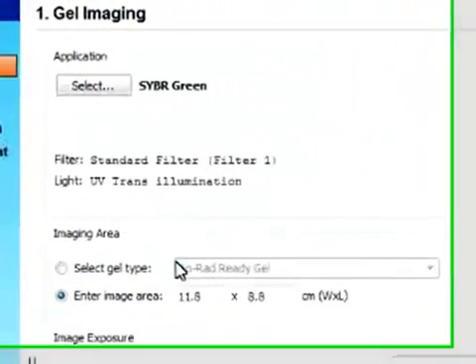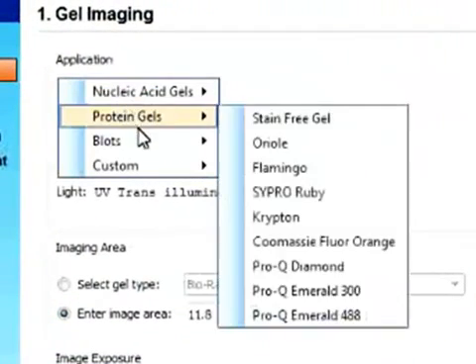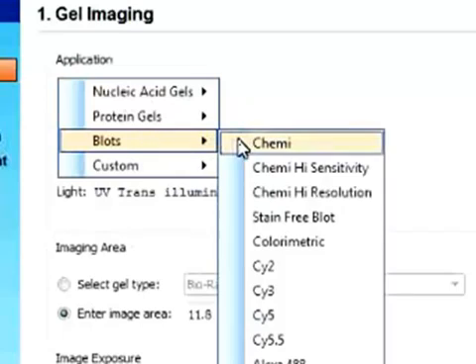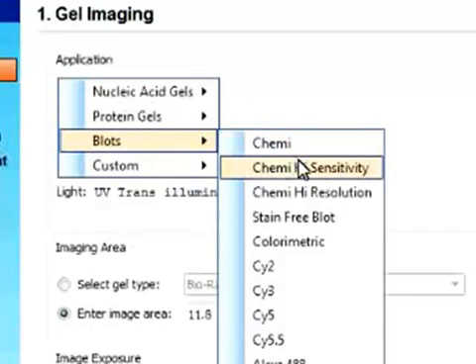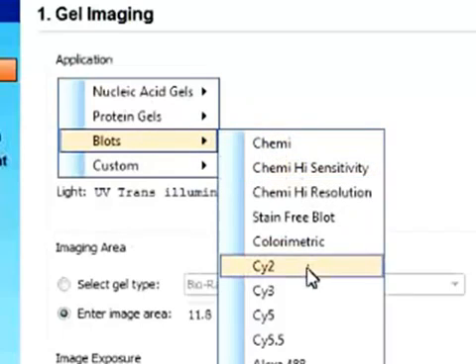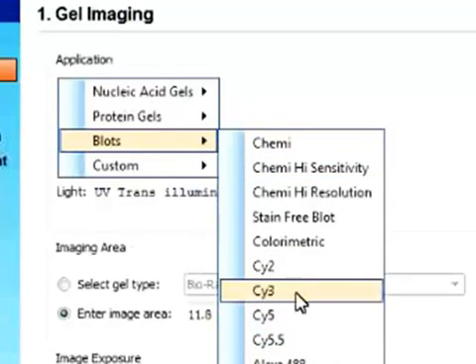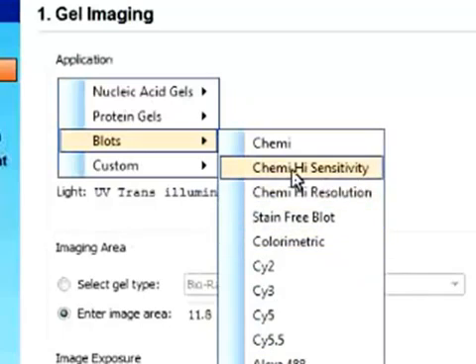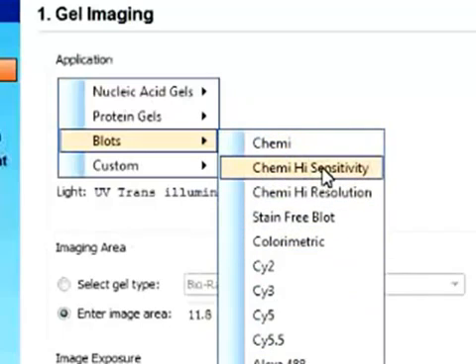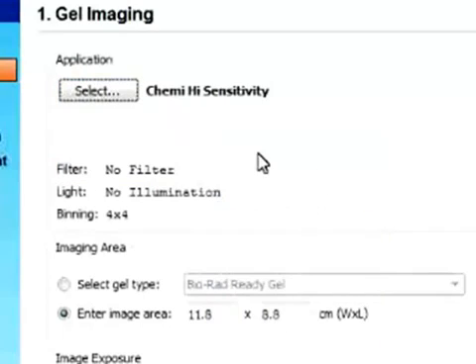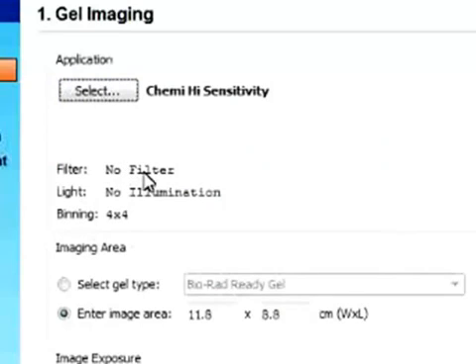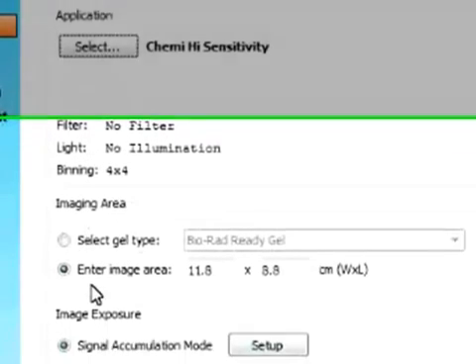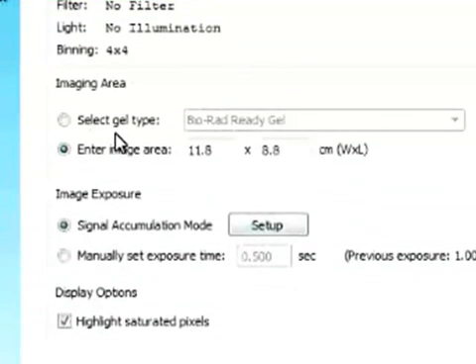So say if we want to look at a blot. We can either look at a chemiluminescent blot or fluorescent label blot. Say if we want to look at a chemiluminescent blot with high sensitivity. And you can see there is no filter and no light source. So no illumination with chemiluminescent blot. This is automatically set.